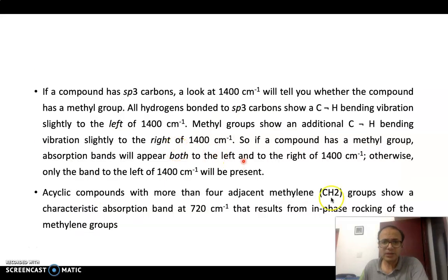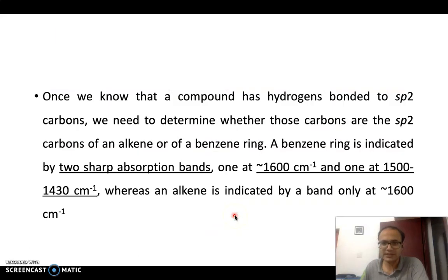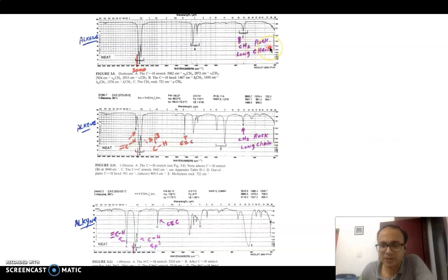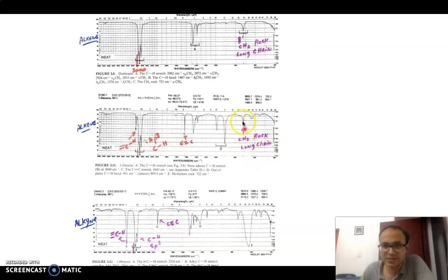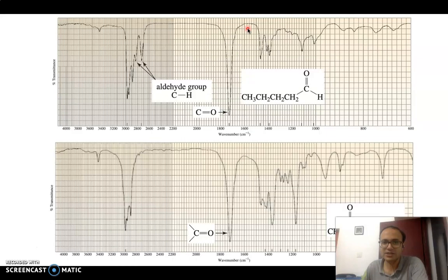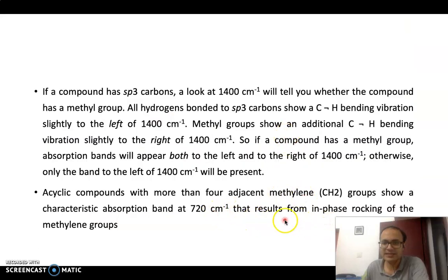When you have a continuous chain of CH2 groups, you will see a peak at around 720 cm⁻¹. For example, dodecane has a continuous chain of more than four CH2 groups, so you see a peak at 721 cm⁻¹ corresponding to in-phase rocking motion. Similarly, 1-decene also contains a continuous chain of CH2 groups, so again you see a peak at around 720 cm⁻¹. This is very characteristic for identifying a continuous chain of CH2 groups in a structure.